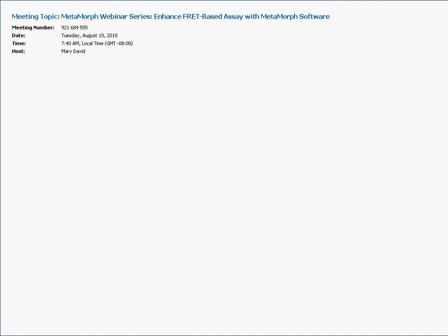And also, do you need to do background correction for both the corrected FRET and YFP images before calculating the ratio? You should always do background subtraction before, because that way what you're looking at is true signal. In this case, this result is probably a bit skewed, because this is an uncorrected image.